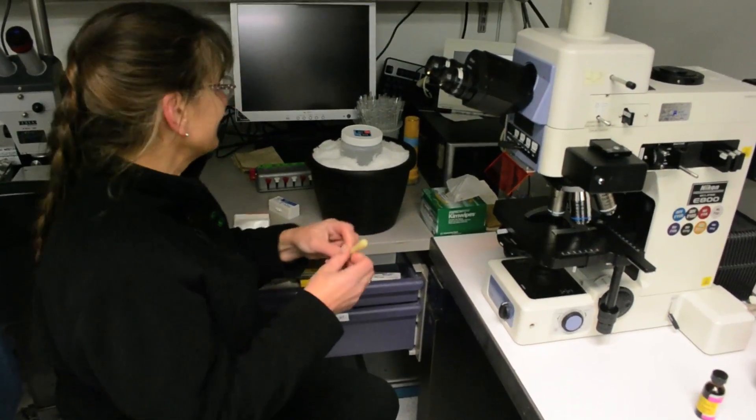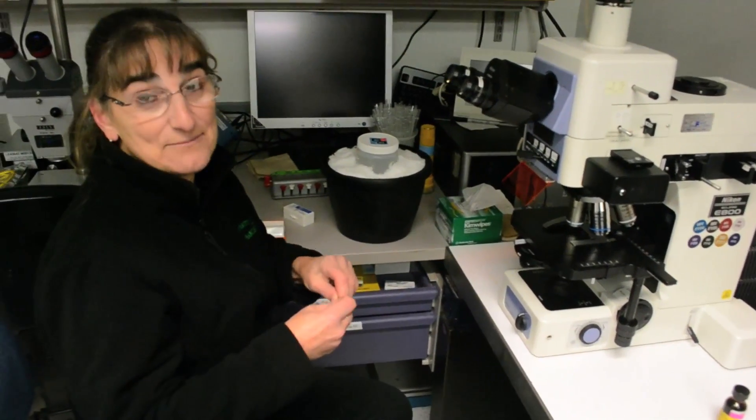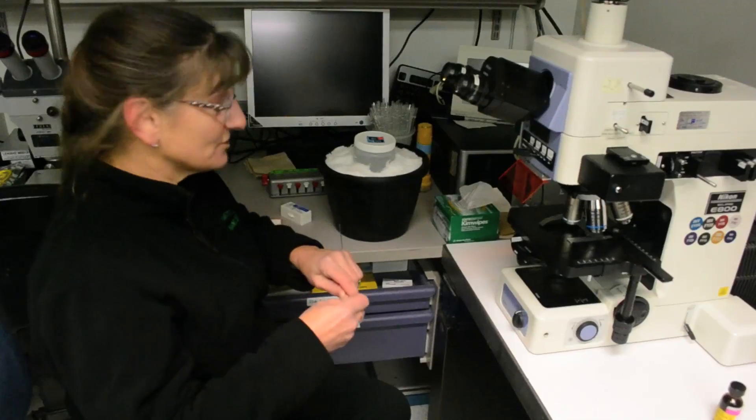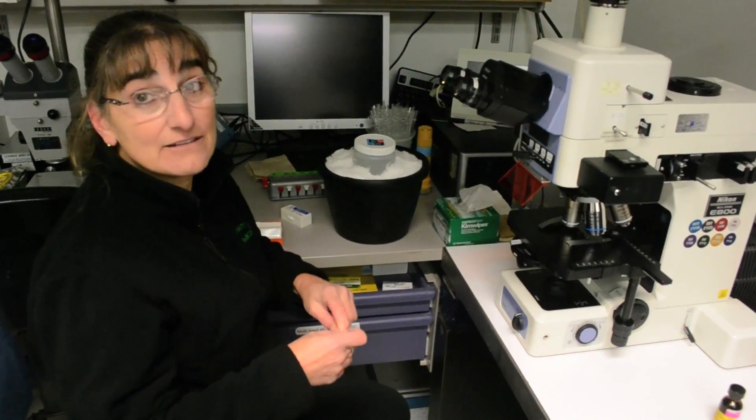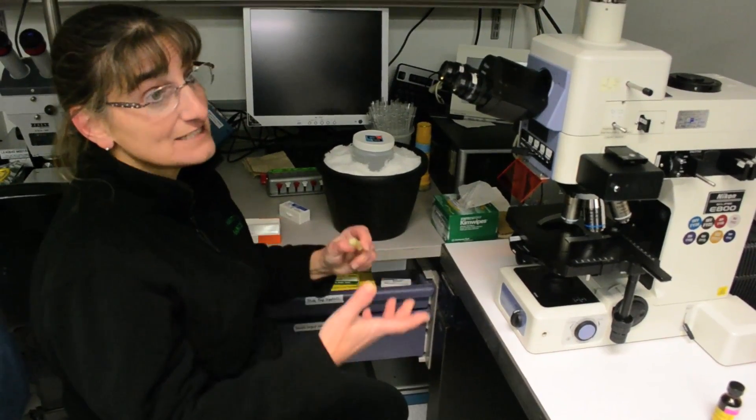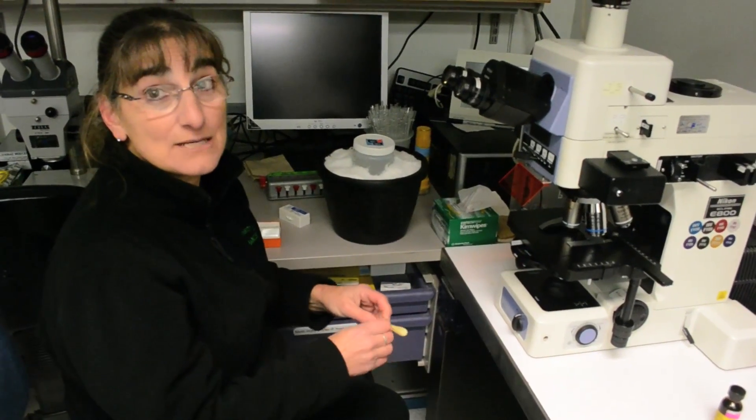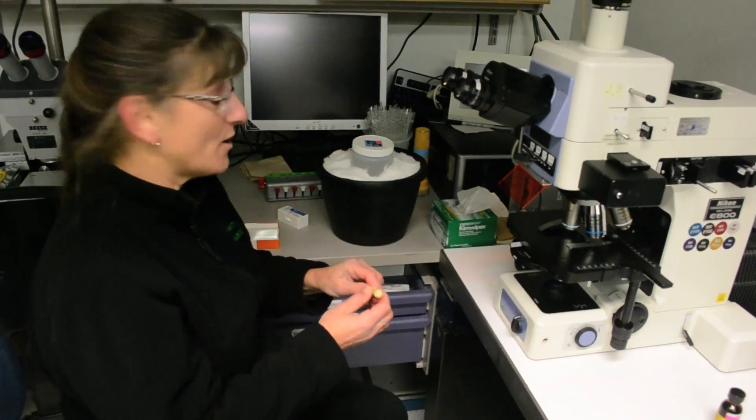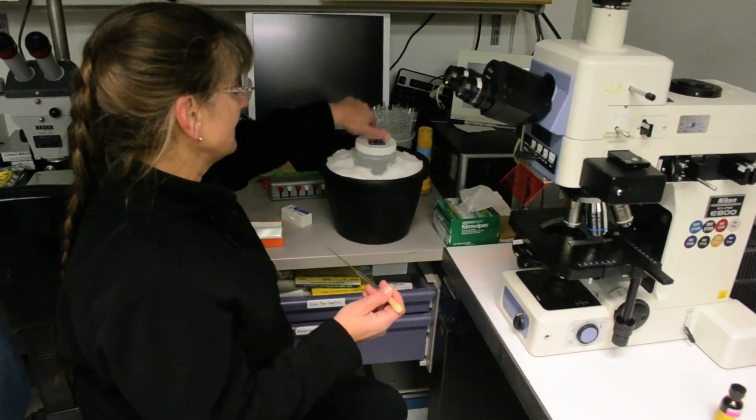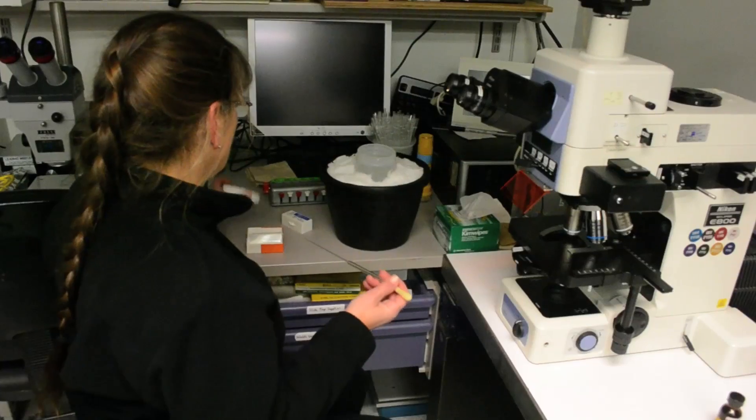Now that we've collected the net sample, what we have is a concentration of the phytoplankton that are in the water. If we had just collected the water and I put a drop on a slide, I probably wouldn't see anything because there are so few cells in the water right now. The plankton net allows us to concentrate everything that's in there.